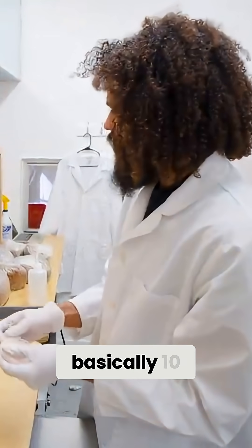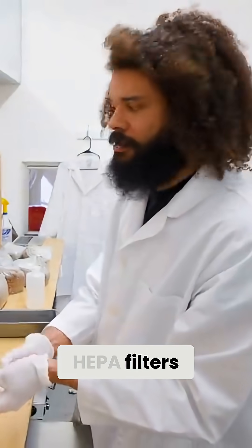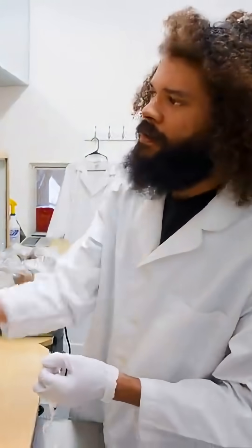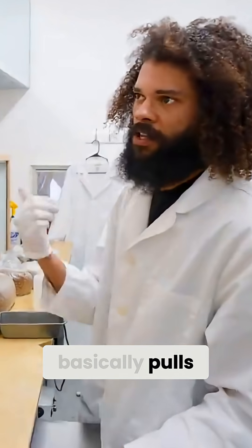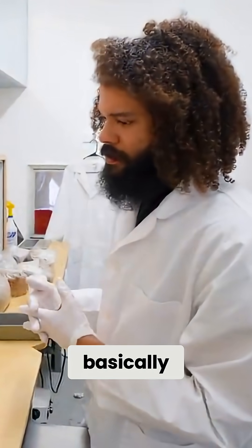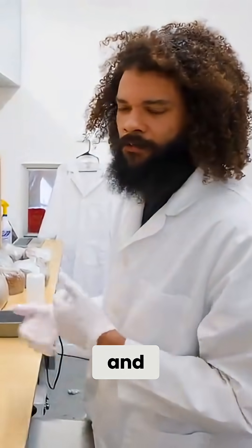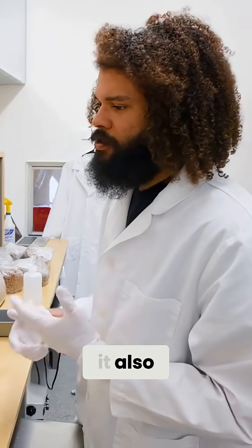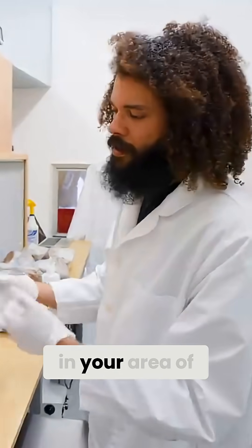The lab at this point is basically 10 foot of HEPA filtration. It's just a few HEPA filters that are built into these cabinets. There's a housing atop each of the cabinets that has a blower attached that basically pulls air in and pushes it through the HEPA filter at a rate that basically makes sure that air coming out of the filter is sterile and free of any kind of airborne particulates or any contaminants. It also basically pushes any kind of dust that could land on your work or in your area of work, basically ensuring a sterile work area.